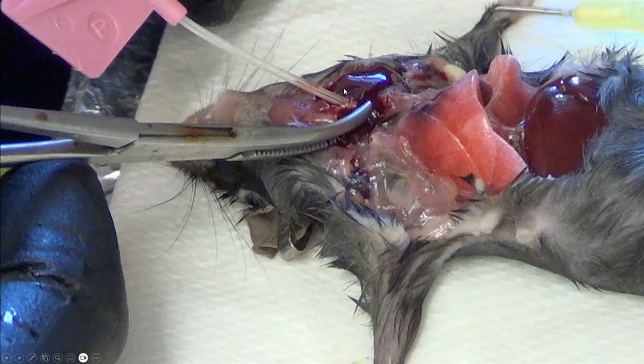And then you clamp it off, and then pour cold Hank's balanced salt solution on the top to wash the lung, and possibly put some ice on top.